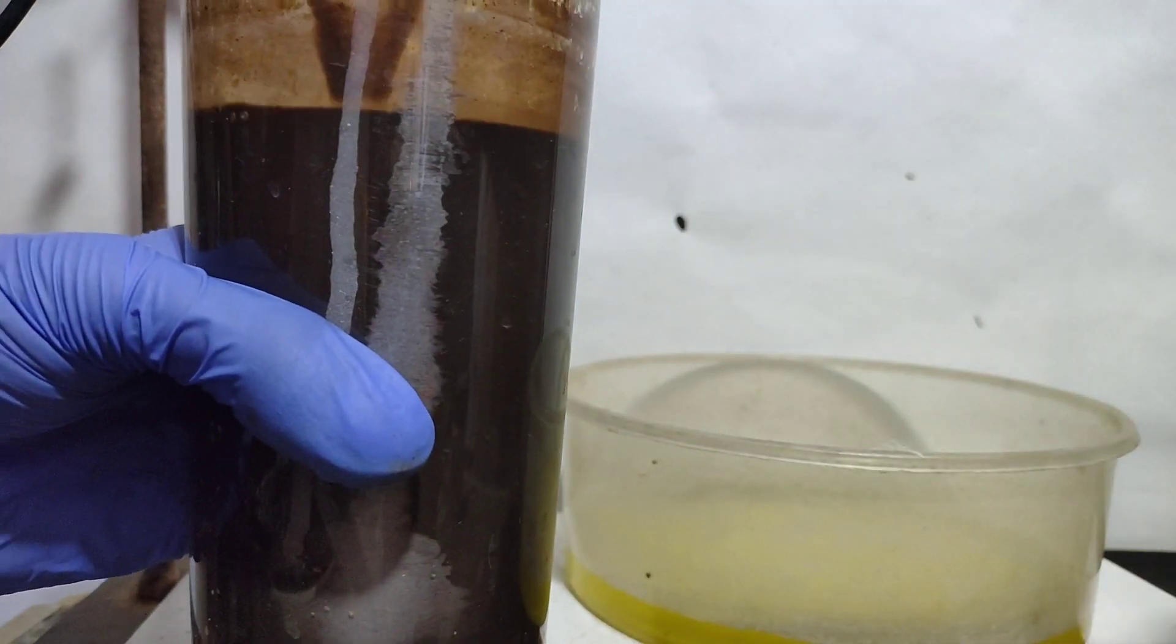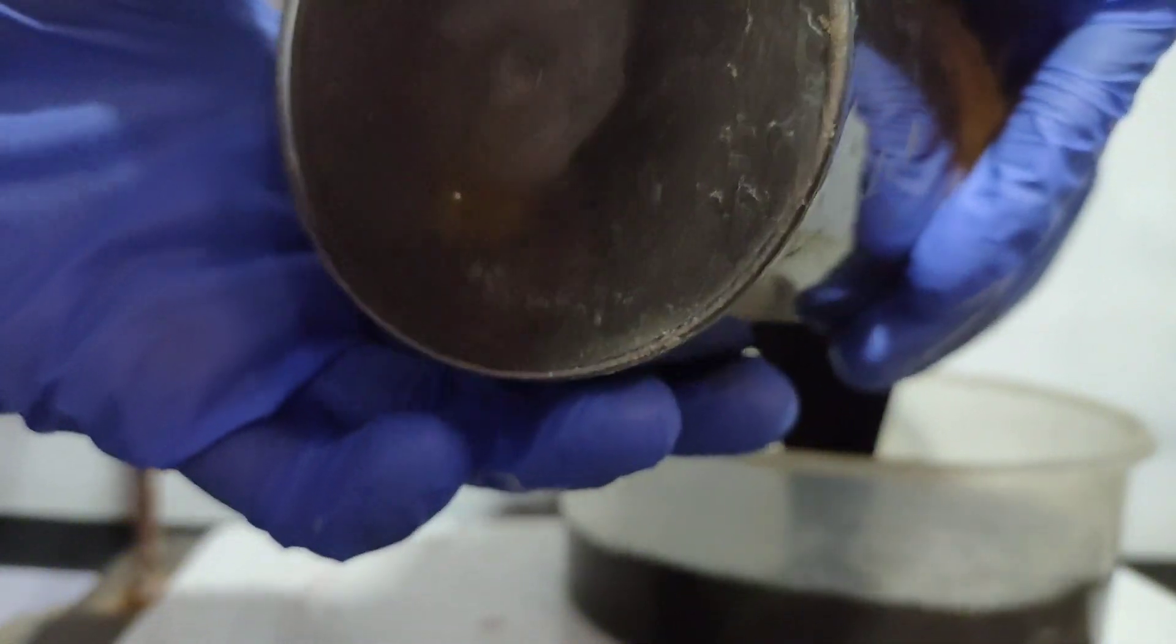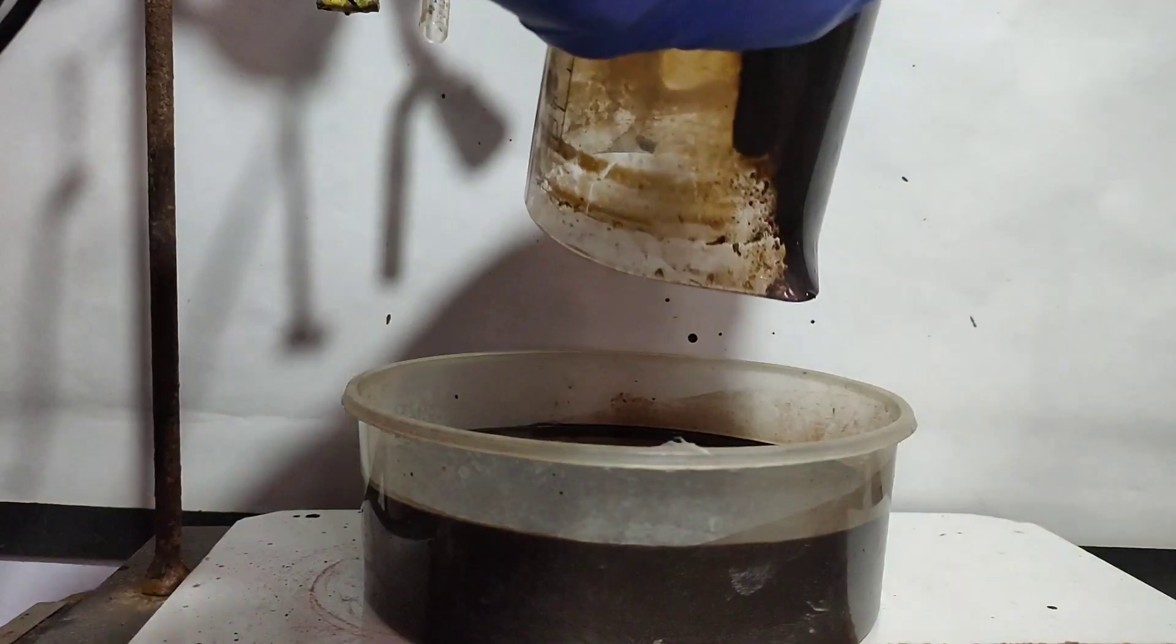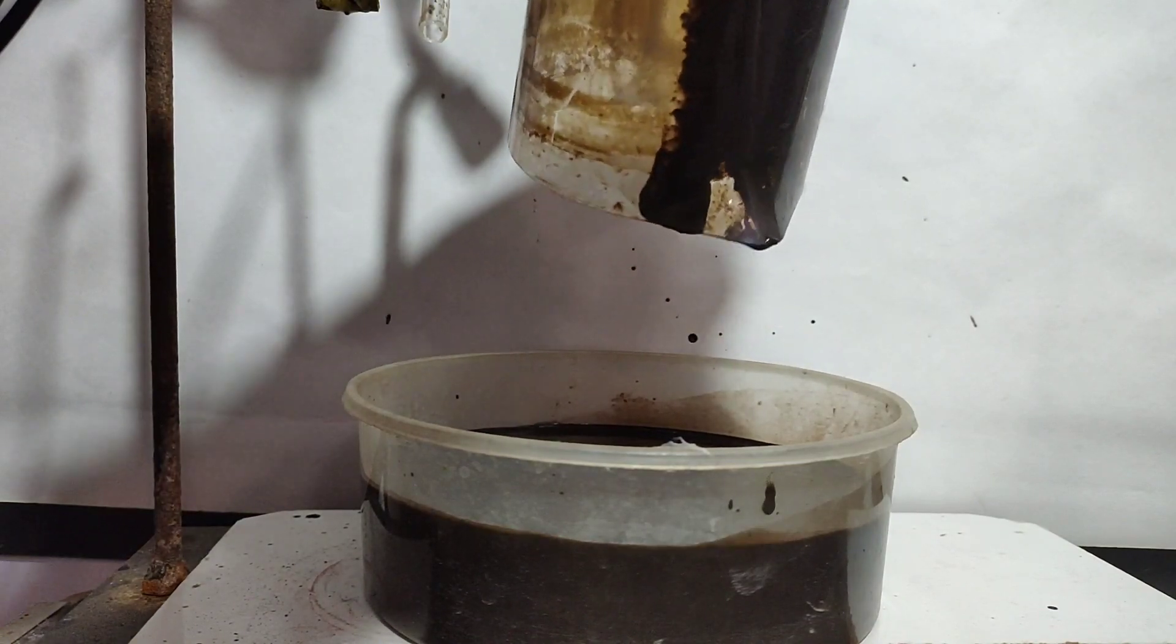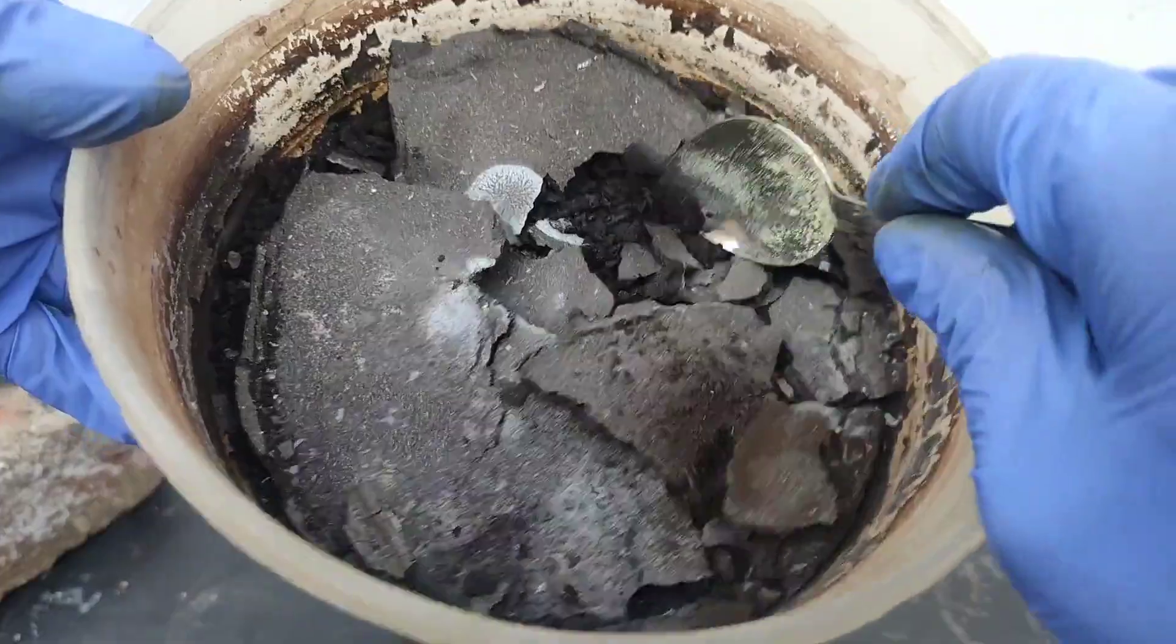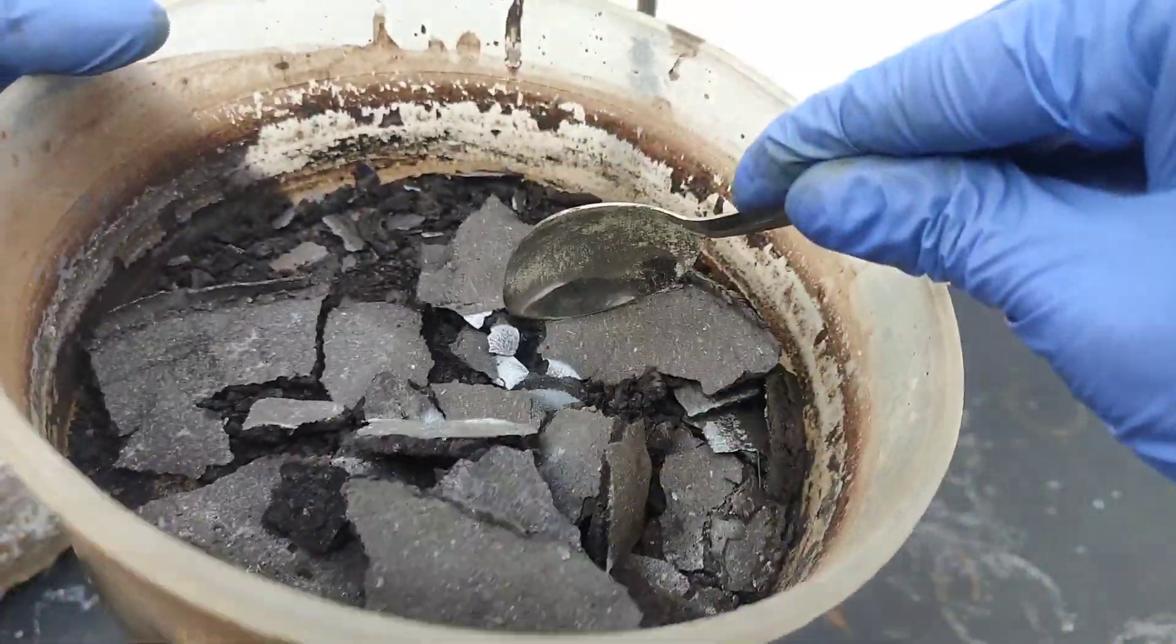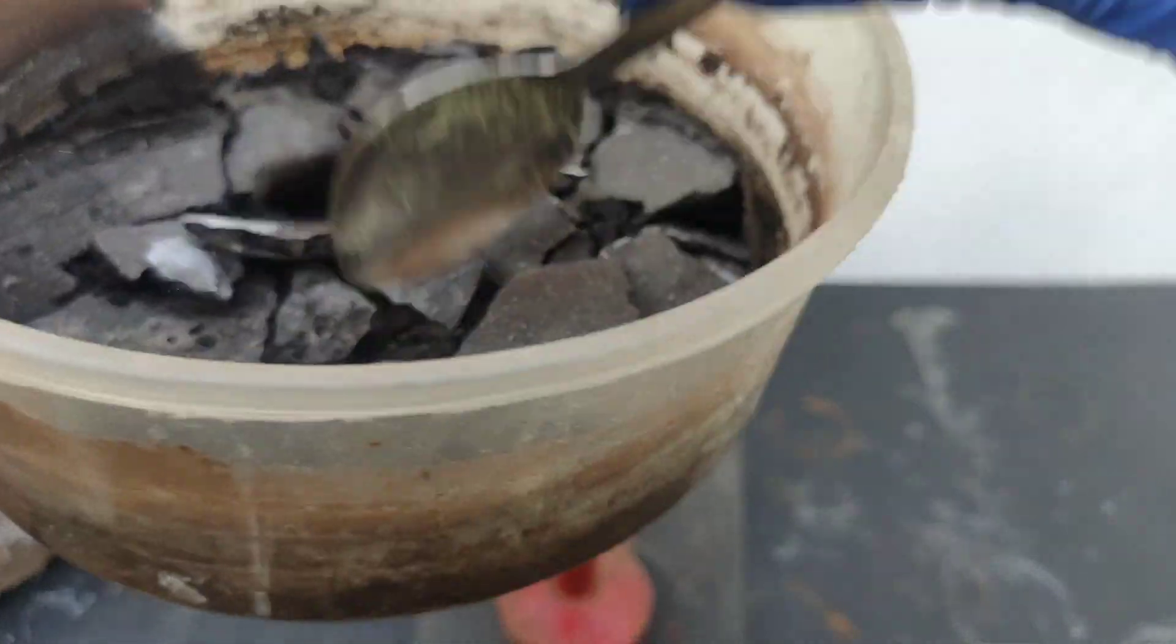This is also used in the manufacture of potassium dichromate from chromate ore. I transferred all the suspension into my 1 liter trough and left it in the sun to evaporate to dryness. After few days, all the solution dried up. I crushed these chunks and transferred this powder into a steel bowl.